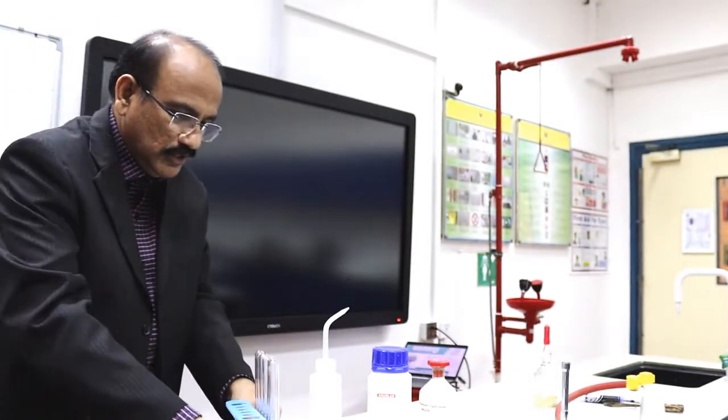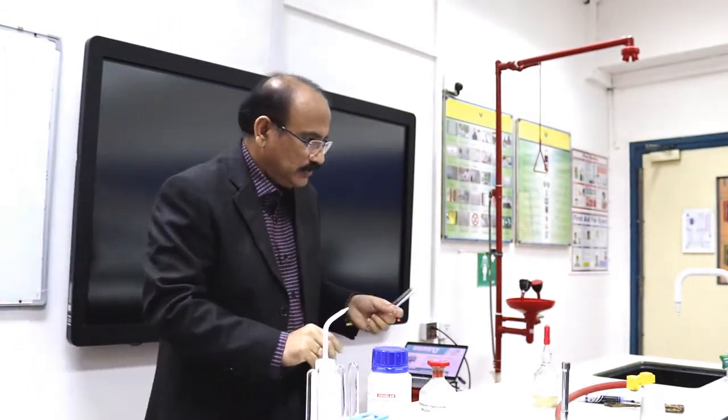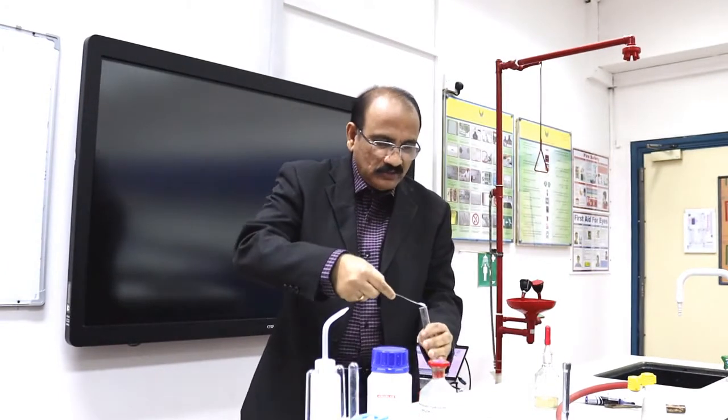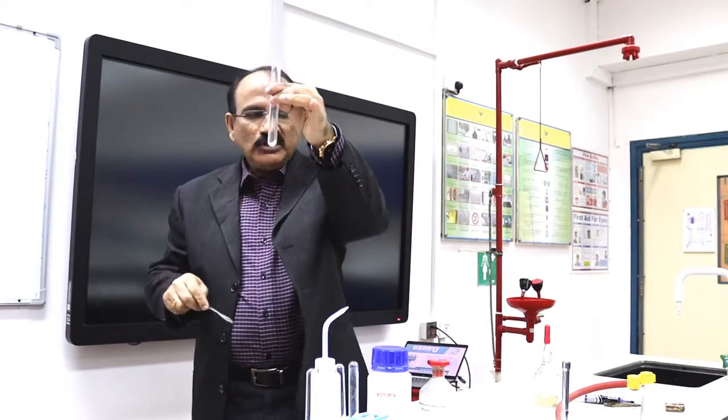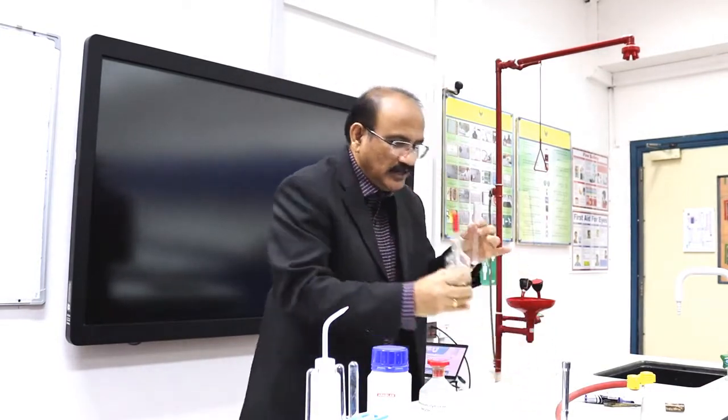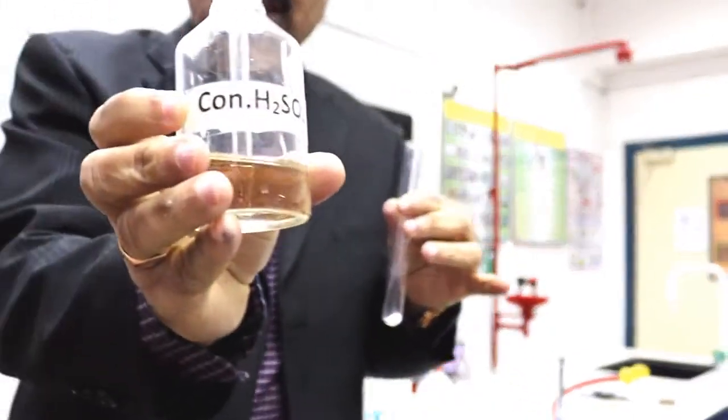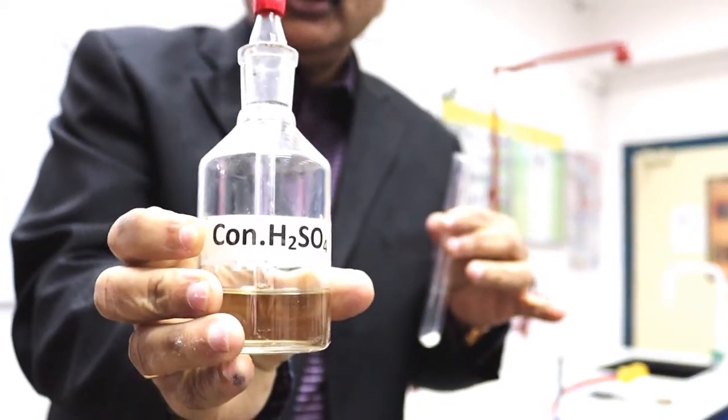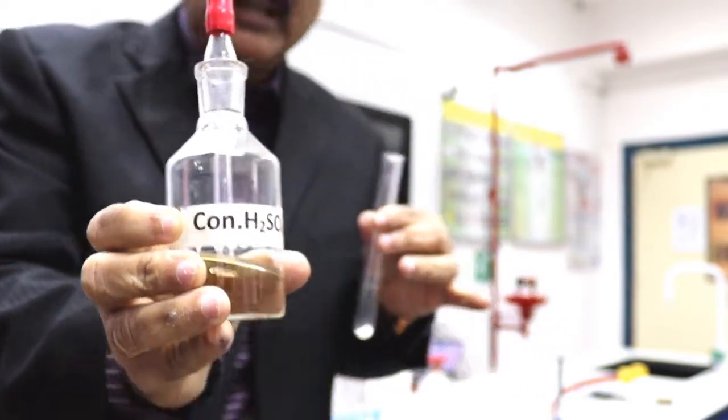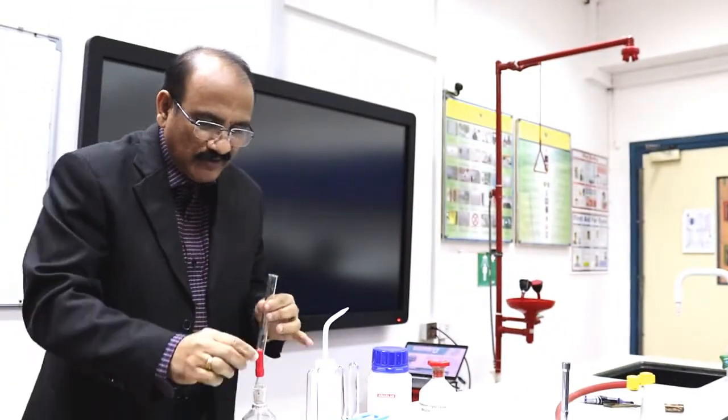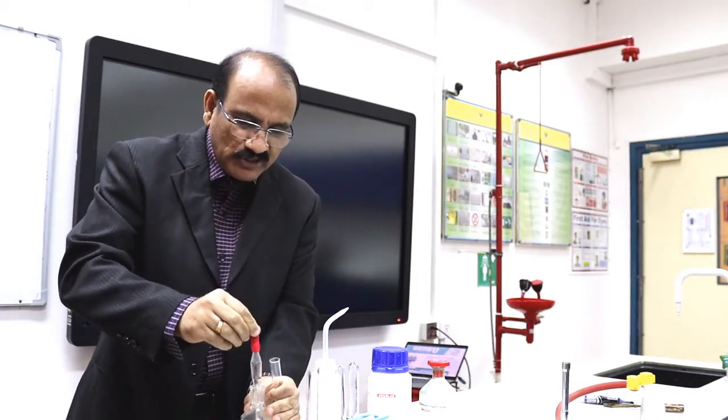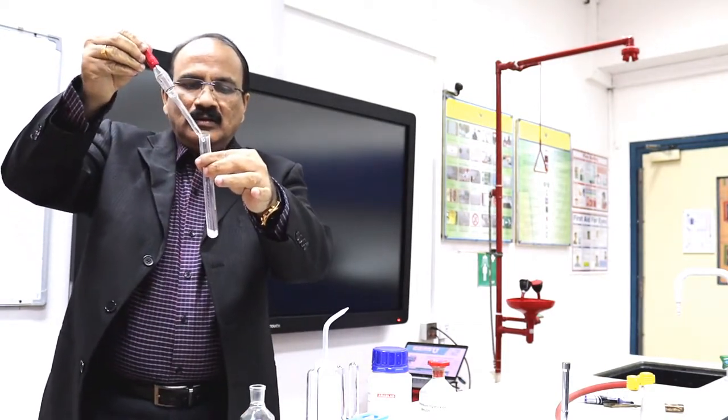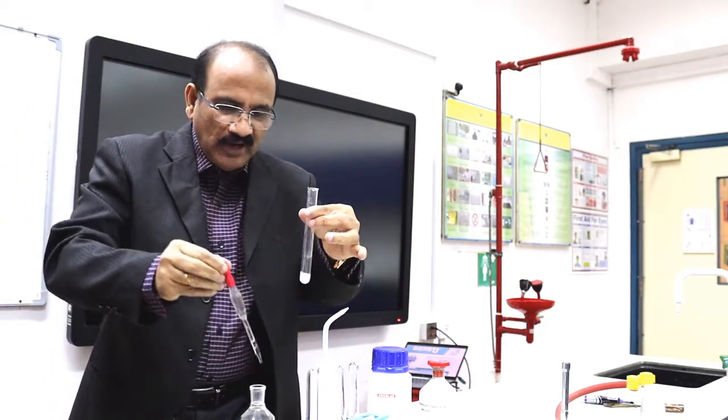Take a dry test tube and put the salt, the given salt into that. This salt is put, and I will add concentrated sulfuric acid. This is very corrosive, so take care. Concentrated sulfuric acid should be handled with care. So I will use a filler for that. I will take concentrated sulfuric acid and I will add. Let's see what will happen. A little more I will add.